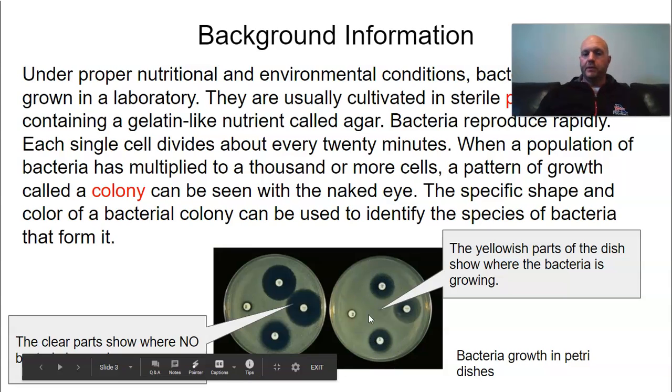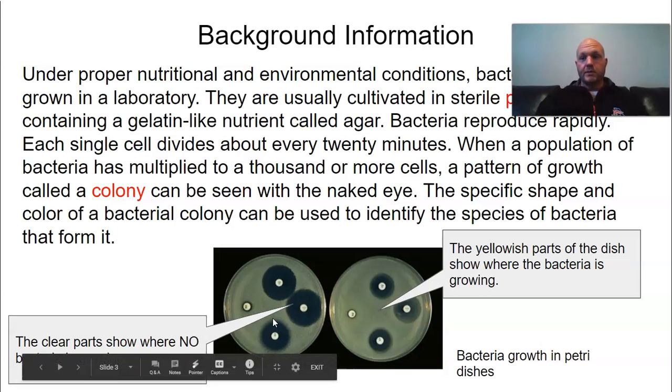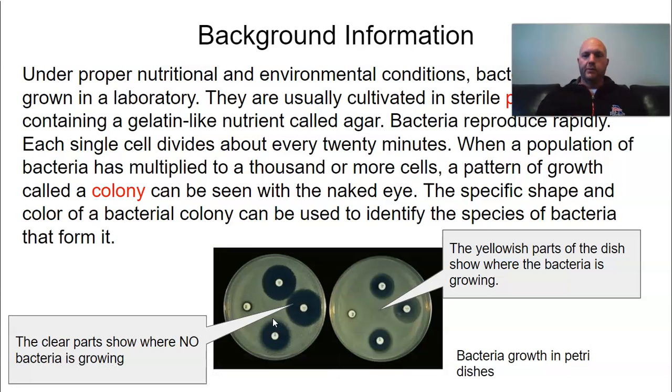So the lab is pretty easy. You're going to fake grow bacteria, put discs on it, and see which one kills the most bacteria, right? Things like household cleaners, bleach solution, soap, all of them on there. We do this lab for real in actual school. It turns out, global pandemic, we got to switch it up a little bit.